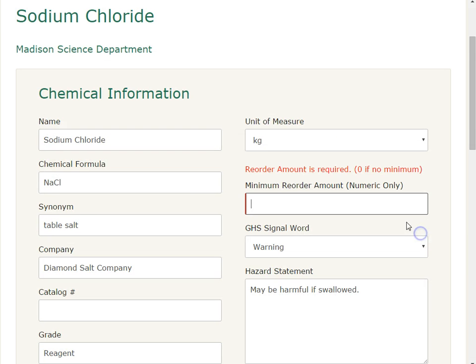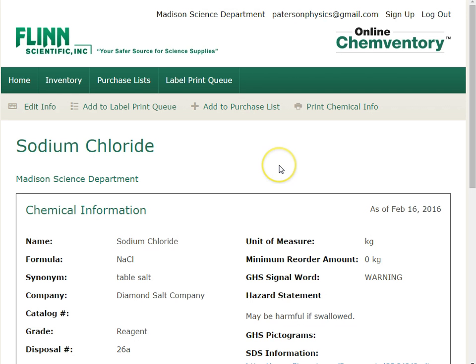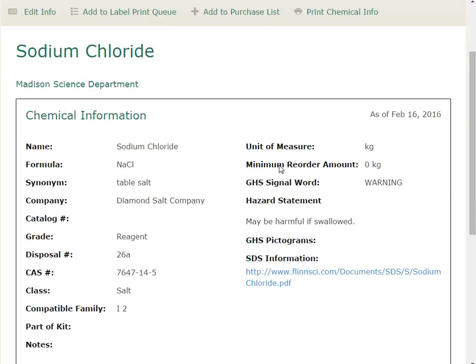And you hit Submit. Oh, and I guess every time it wants you to make sure that you're putting in the reorder amount. That's a little frustrating, but that's okay. Okay, and there it is.